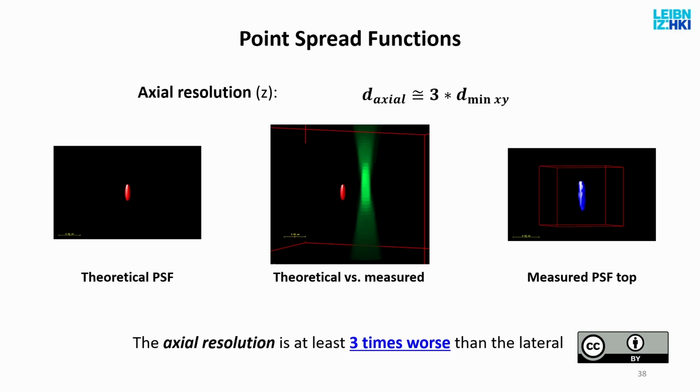And a couple of properties before we stop for a few minutes. By knowing the numerical aperture and the optical properties of the optical elements of a microscope, you can always calculate the point spread function. So you can always estimate what the microscope will do, even if you don't know your sample. Of course, this means that everything that has to do with the sample, like light scattering, will not be known, and that's not a perfect solution.